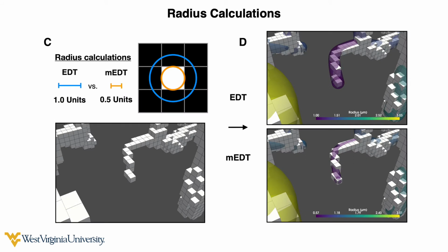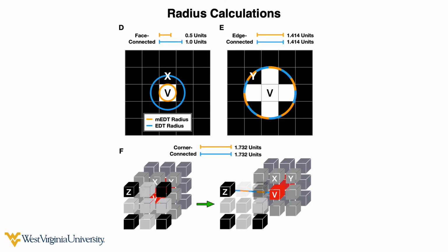In the next new approach, I sought to improve the radius analysis of at-resolution vessels. Previous approaches find the radius of vessels by calculating the distance from the vessel center to the center of the non-vessel nearest neighbor. This approach works well for large vessels, but inflates the size of small vessels, as seen here. In VesselVio, this distance calculation is slightly modified, enabling the analysis of at-resolution vessels.